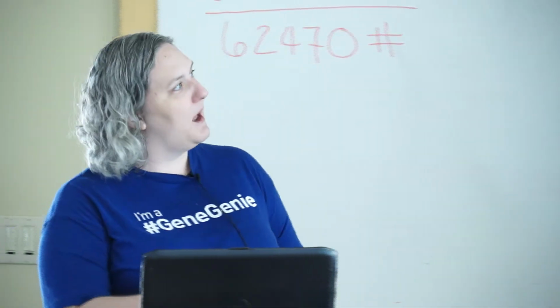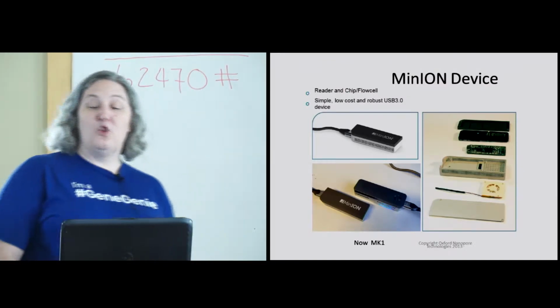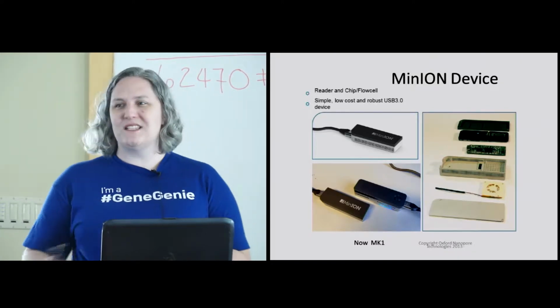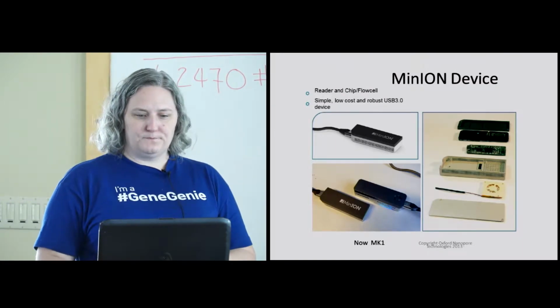Alrighty, now of course what you're seeing now is the Mark 1 MinION. That's this guy here. This was the early access MinION. These guys have been retired now. They've really improved the electronics and the cooling system, for example, in these devices, and the way the flow cell actually nests into it. There will be a Mark 2 sometime in the future, which is ill-defined, but this is where we are now. That's what's being passed around the room.